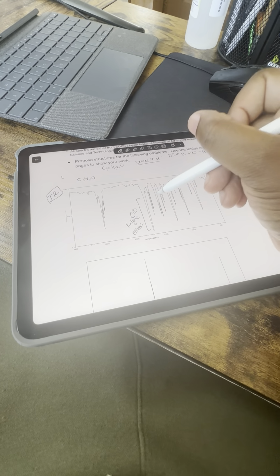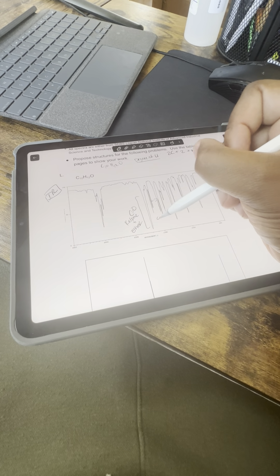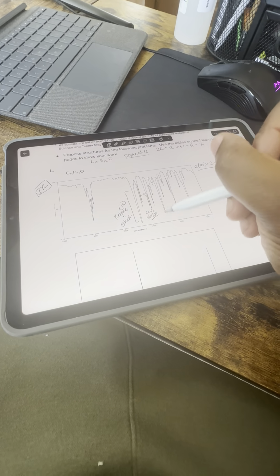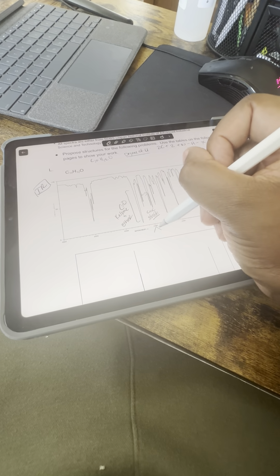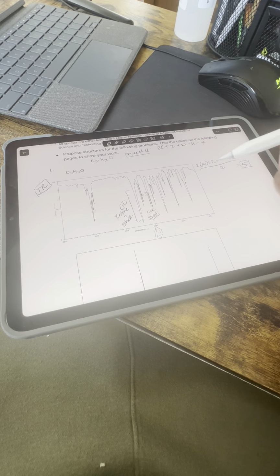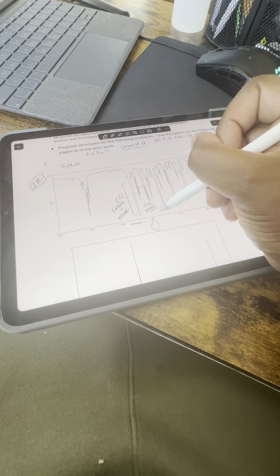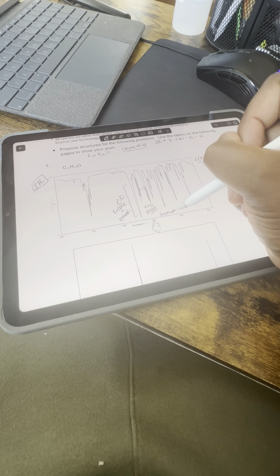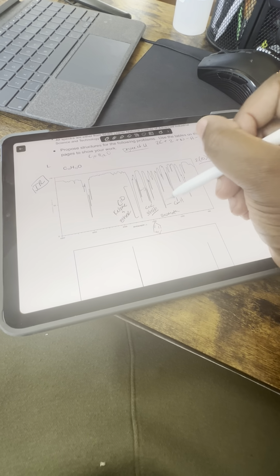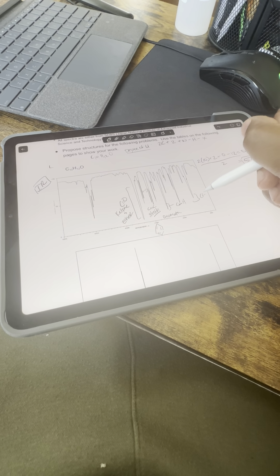Now looking at these two peaks here, there's a C=C stretch, and this tells us that we have a benzene ring, but in this case I'm going to refer to it as an aromatic ring. And then this one here is a CH bend, and at this peak here, we have another CH bend.